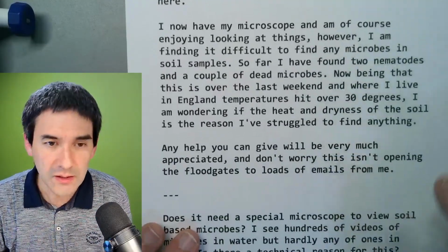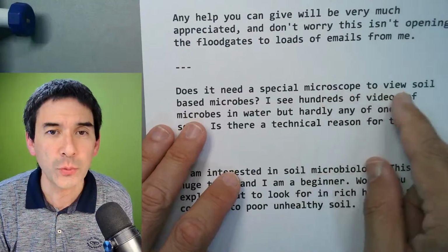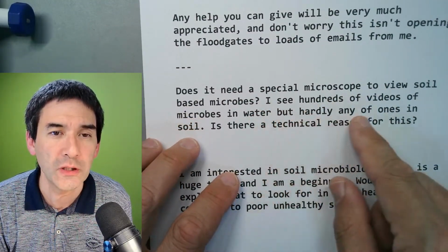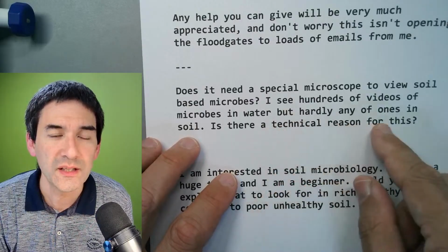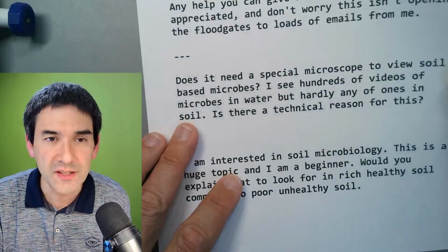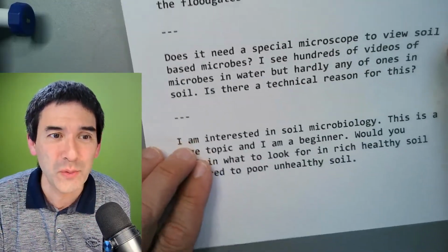And then the second question is the following. Does it need a special microscope to view soil-based microbes? I see hundreds of videos of microbes in water, but hardly any of ones in soil. Is there a technical reason for this? No, not a technical reason. I will also talk about that. The reason is because there are different kinds of microorganisms in soil, and they don't swim around as much.